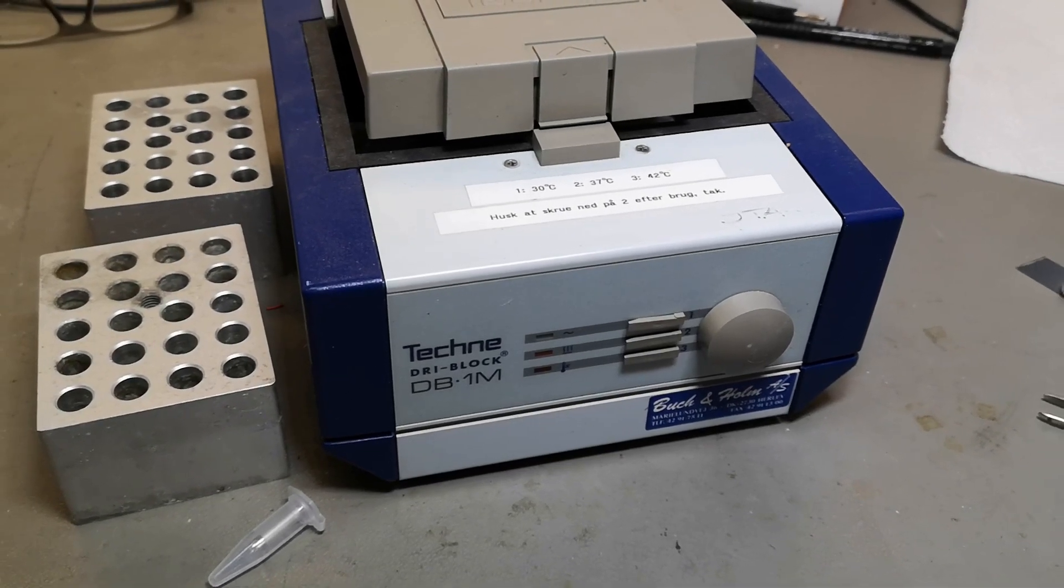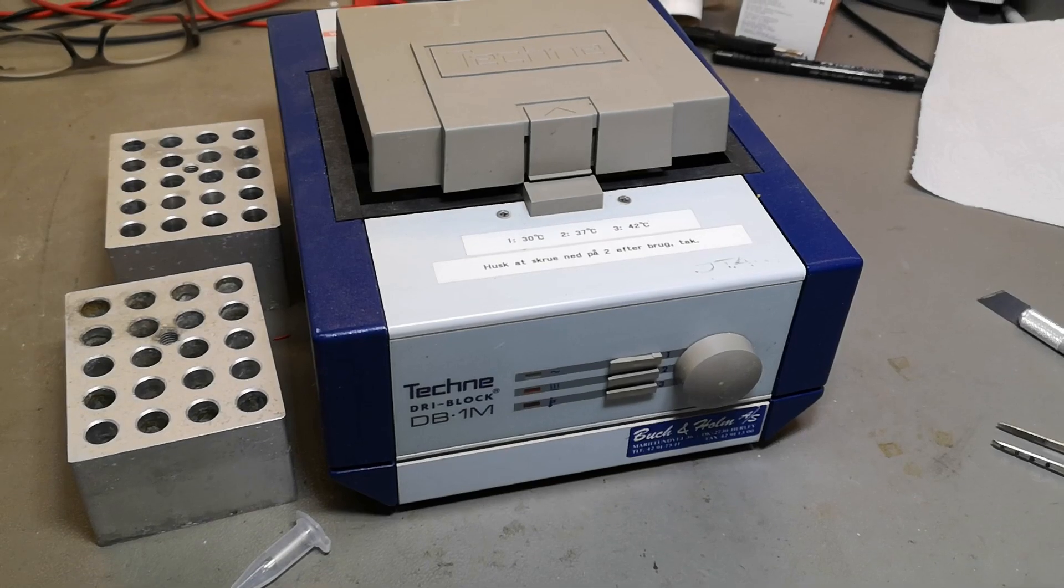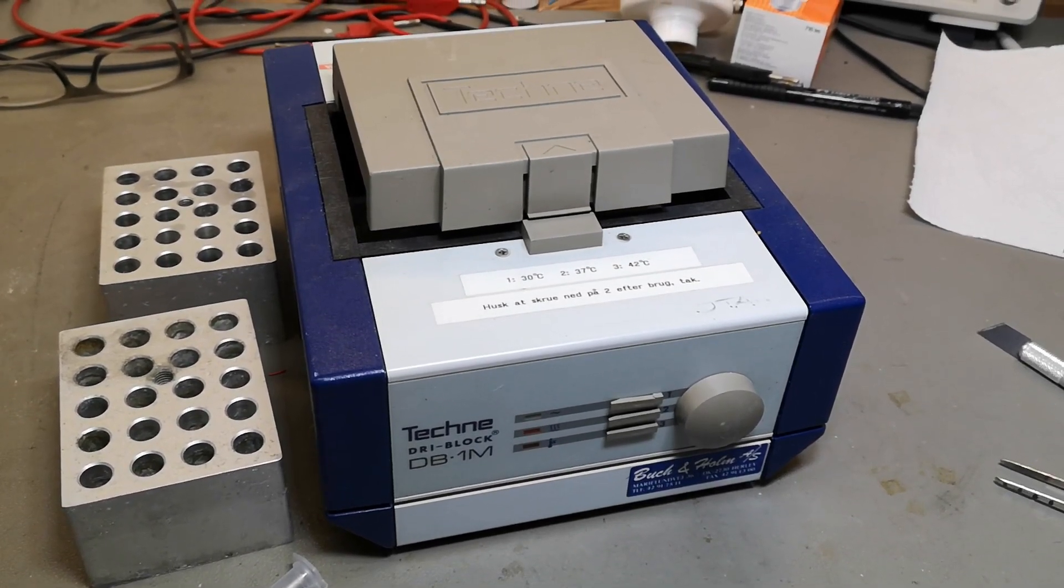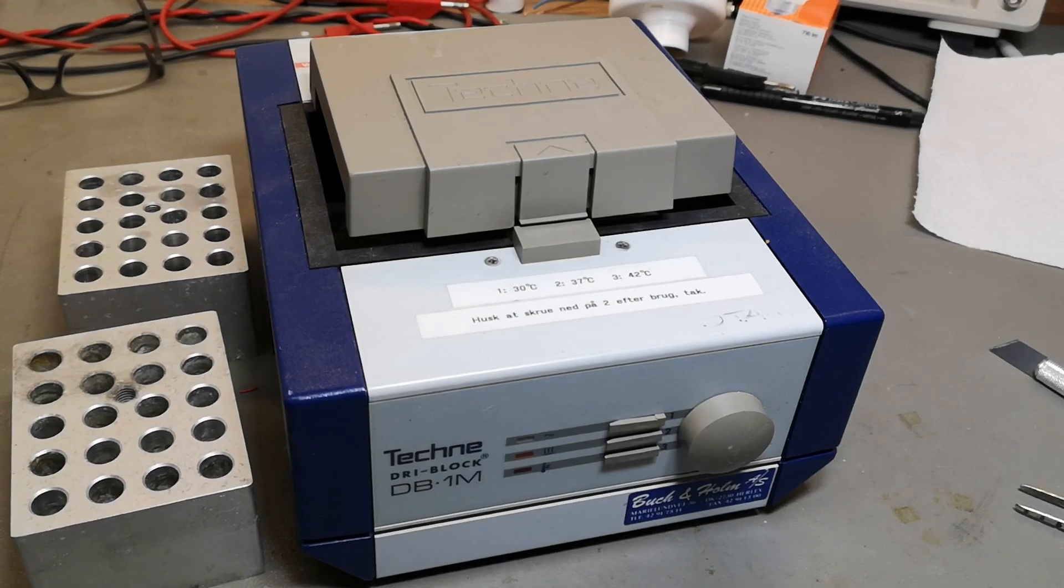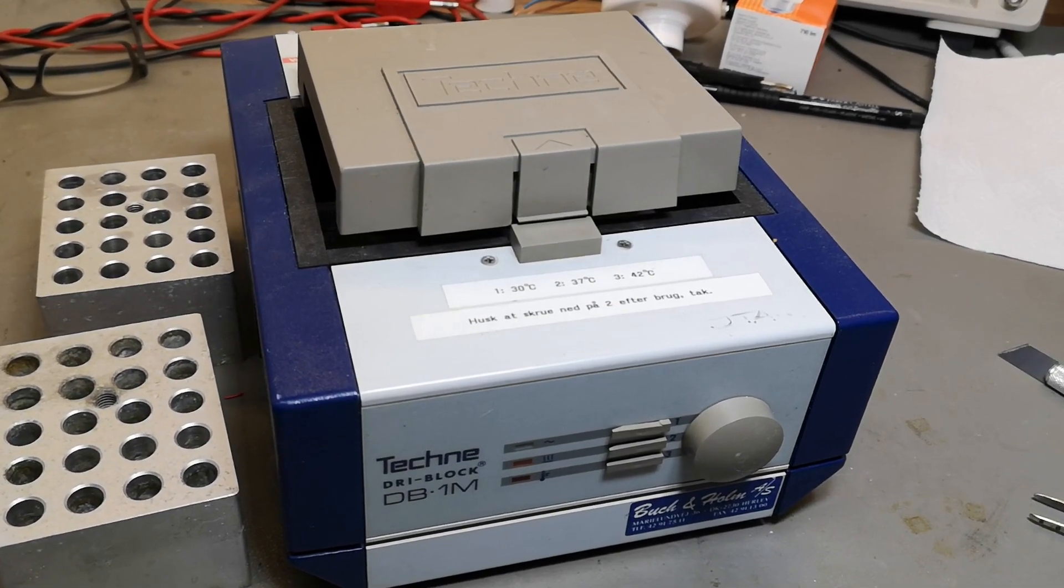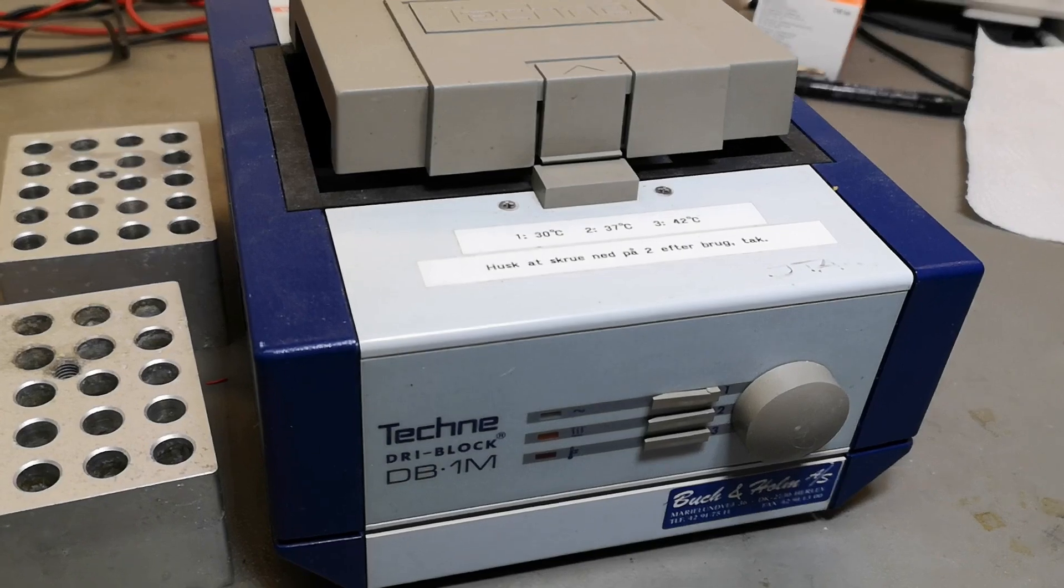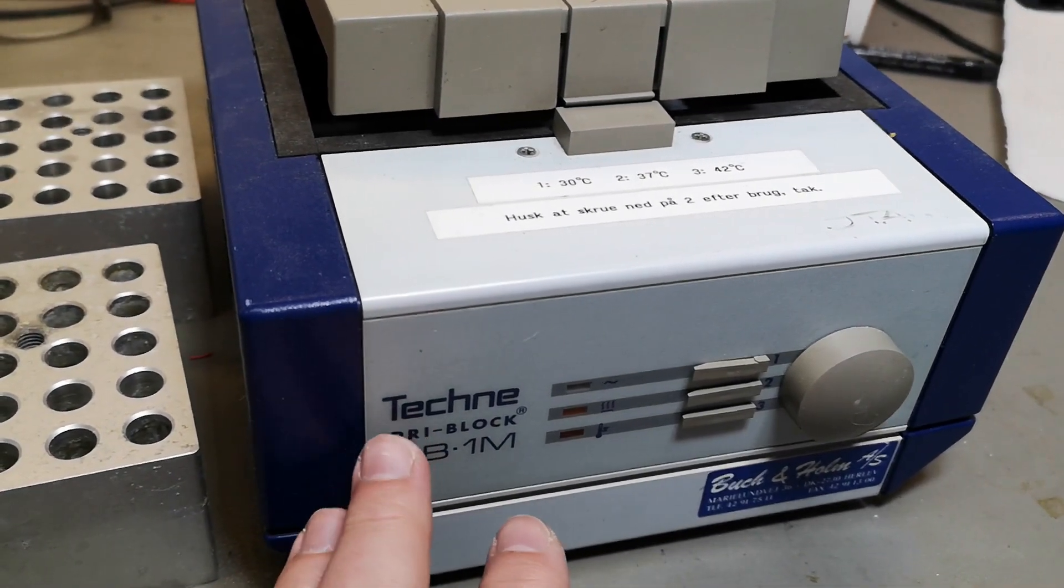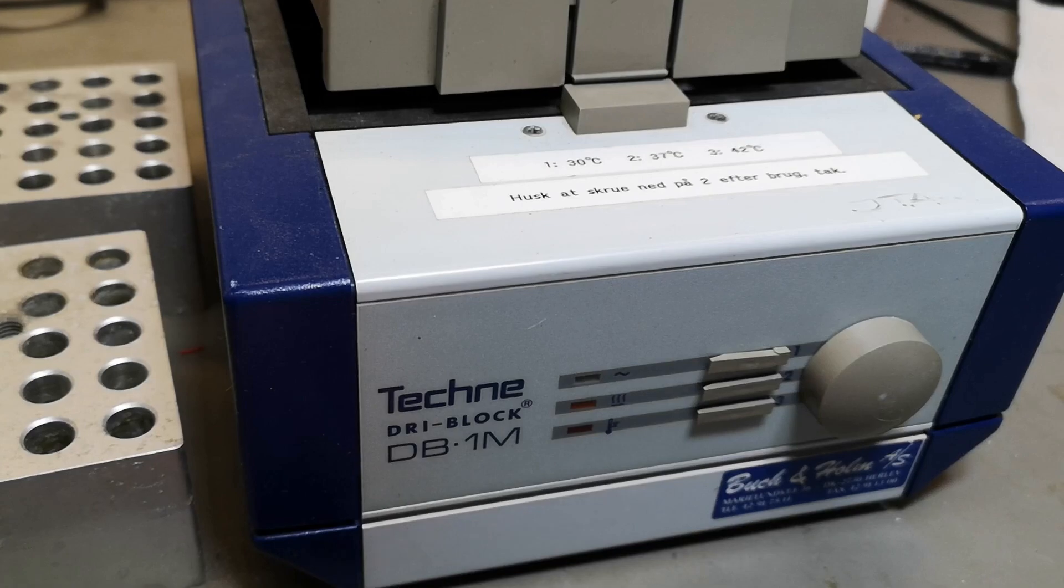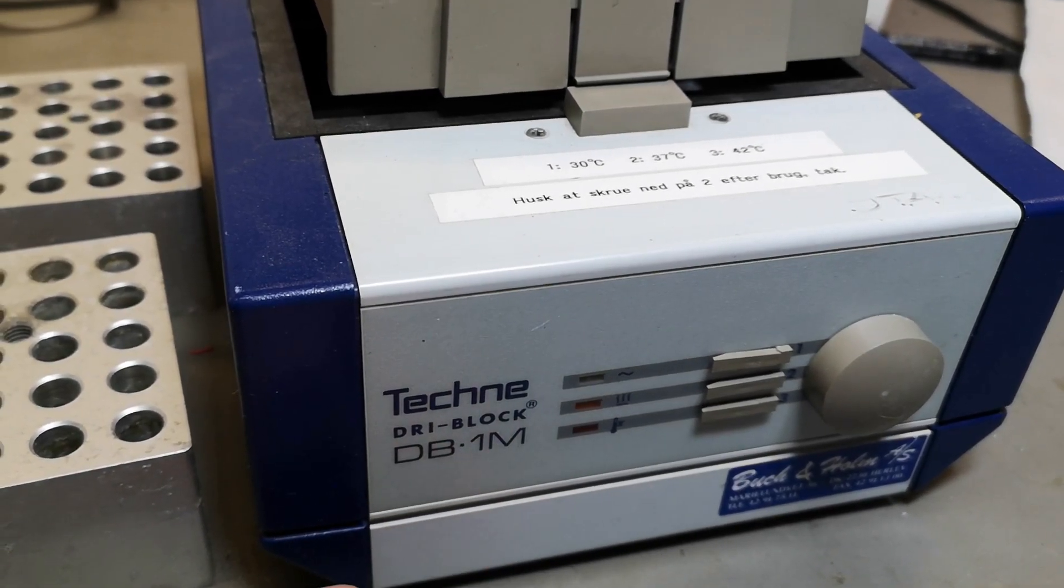Welcome to a new test and teardown video. This time it's some more funny equipment from the biolab or medical lab. This one is a heater, I believe it can only do heating, but it's called Techne Dri-Block DB-1M.